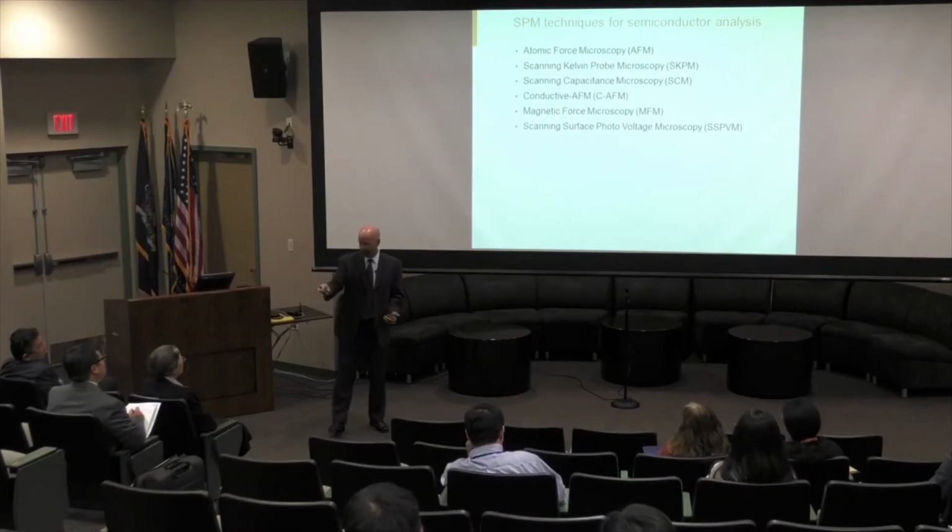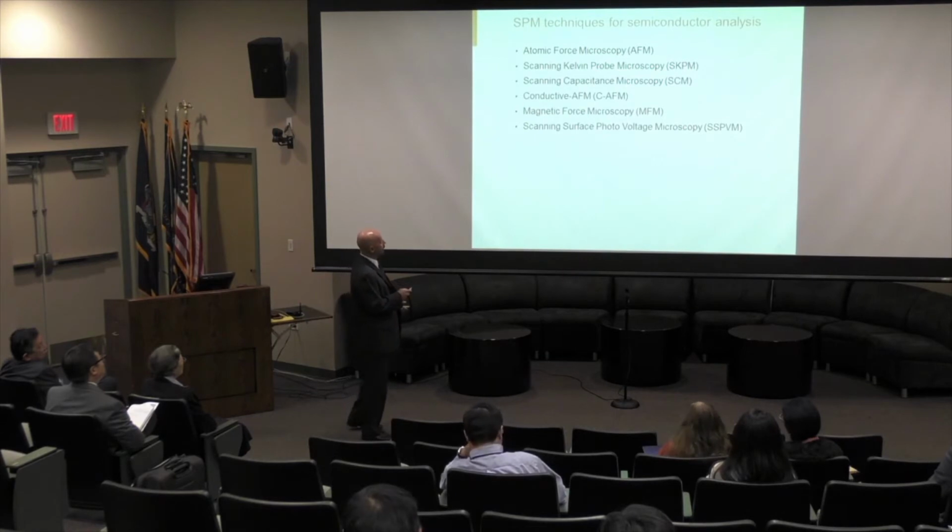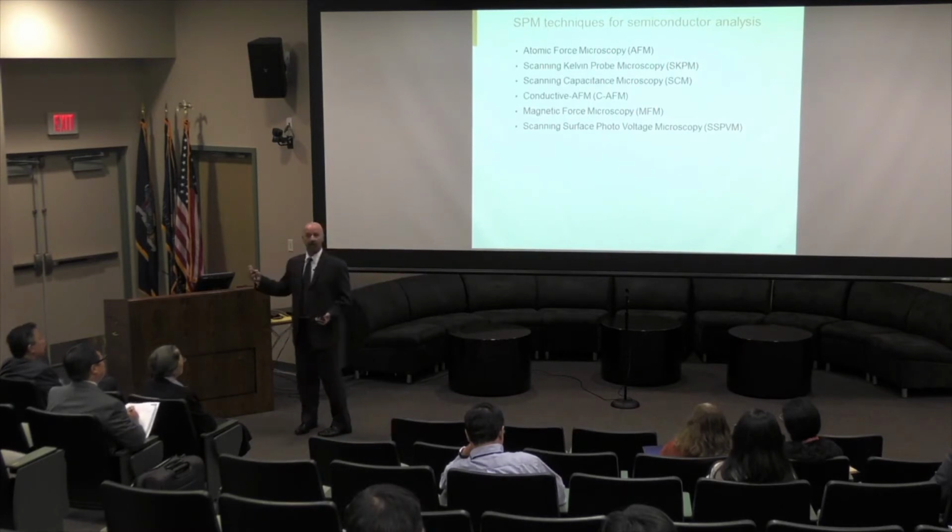And then there's conductive AFM for looking at electrical properties, and magnetic force microscopy, for which there are applications in semiconductor analysis as well. And then a technique that we developed in our lab, the scanning surface photovoltage microscope, which we have used for analyzing stress on a nanometer scale.